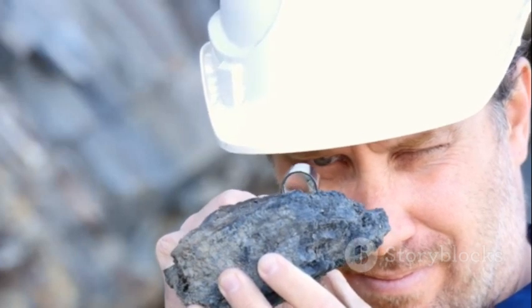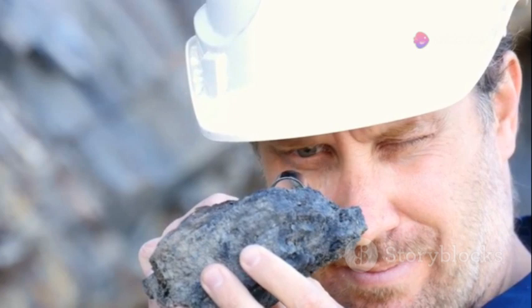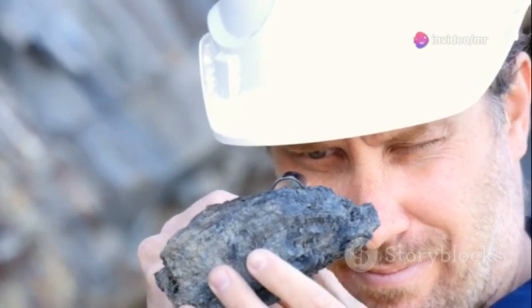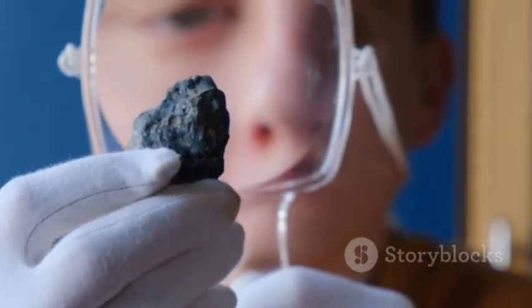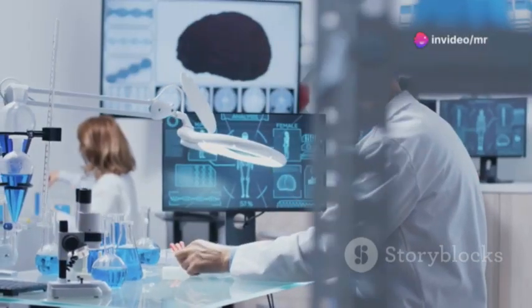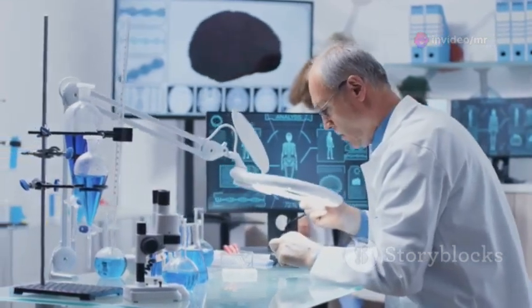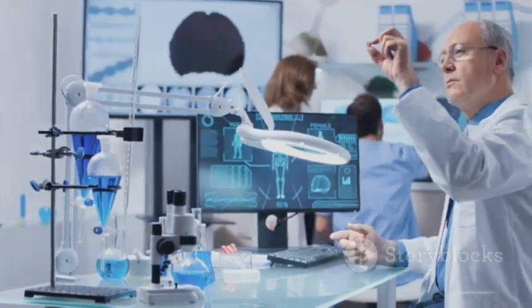Geology. Geologists use XRD to identify minerals, study rock formations, and understand the history of our planet. This helps us learn more about Earth's past and predict future geological events. By analyzing rock samples, scientists can uncover the secrets of Earth's formation and evolution. Material science. XRD helps us develop new materials with improved properties for applications in electronics, aerospace, and energy. This leads to the creation of more efficient and durable products.